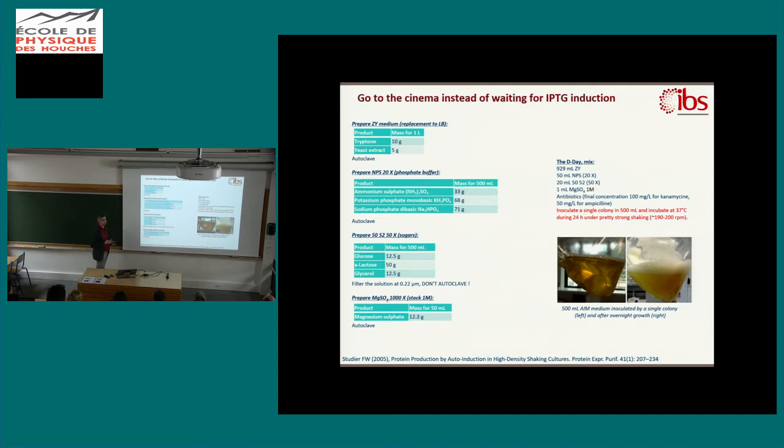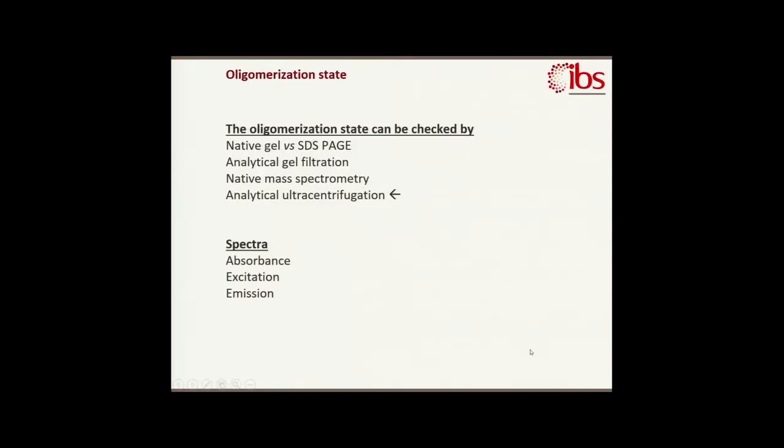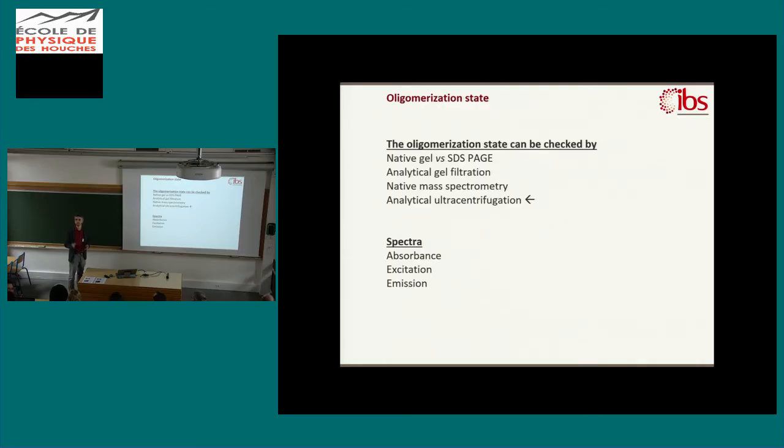And that's a convenient thing because we are working a lot in XFEL, so X-ray free electron laser, and we need grams of crystals, so really a lot of grams of proteins, and that's a lot of work for that. Yes. Where is it going? Sorry. BL21 DE3. Yeah.